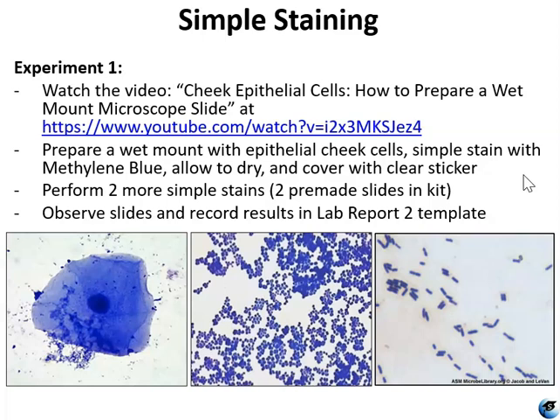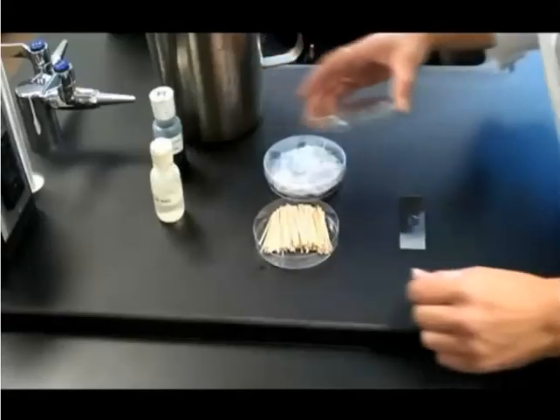And then you're going to do a simple stain with that wet mount slide. And there is a really good demonstration of how this procedure is done in this video.